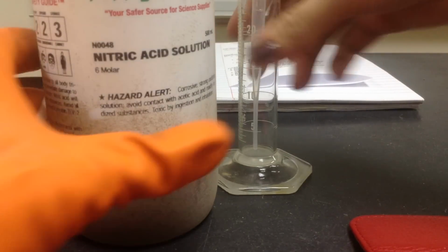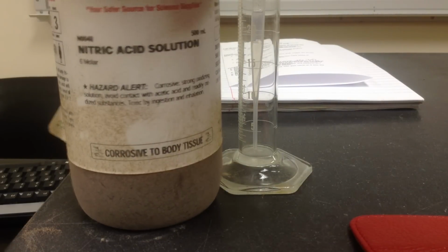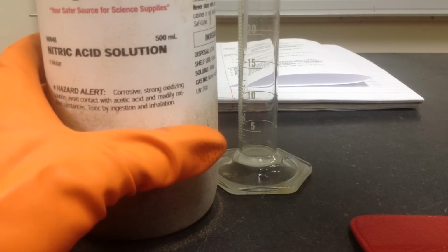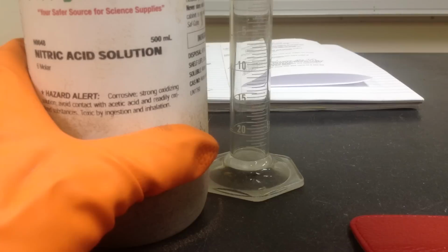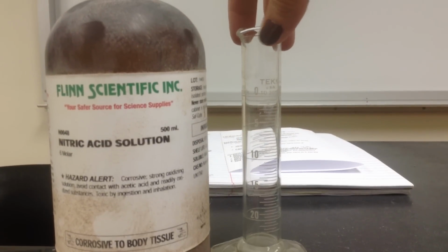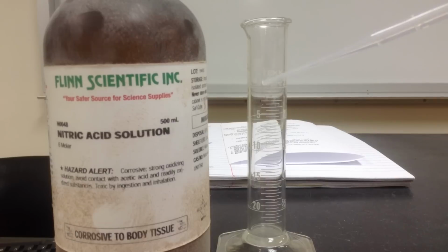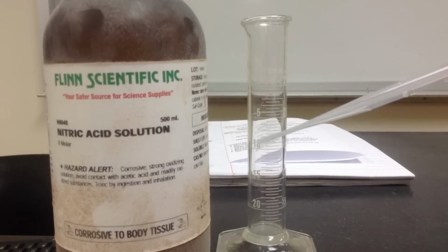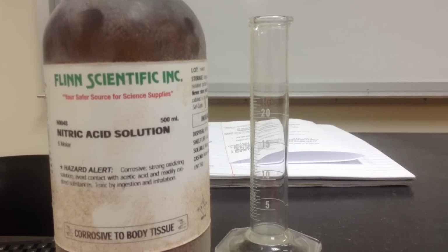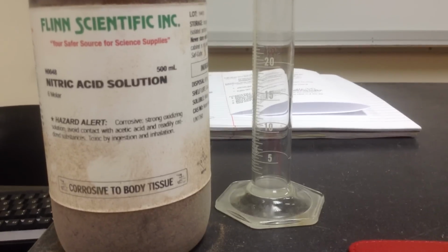6 molar nitric acid. On this graduated cylinder, it has graduations marked on both sides. This leading up to 0 would be helpful if I was pouring amounts out. It would help me read what was poured out. Since I'm trying to measure what I put in, I'm going to use the side that goes from 0 up to 25.